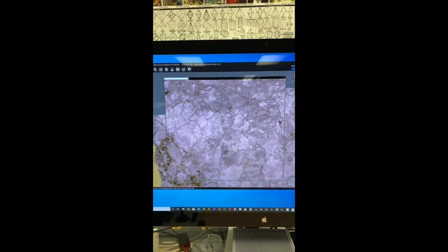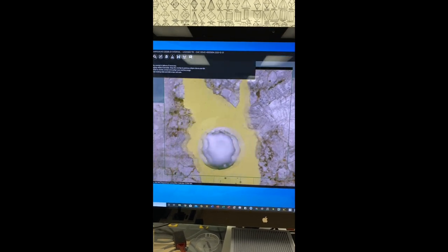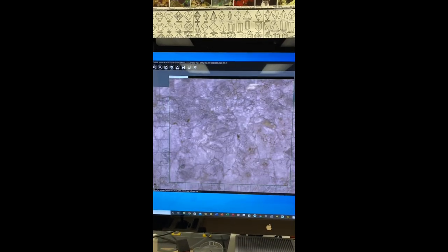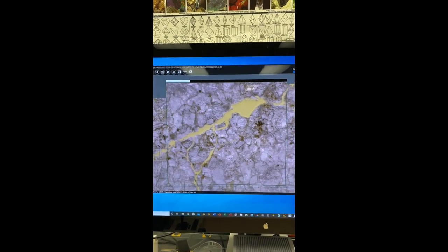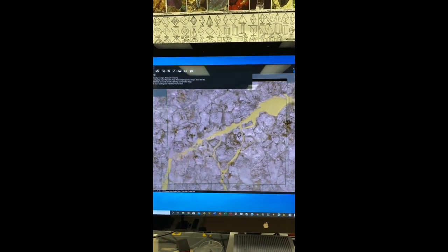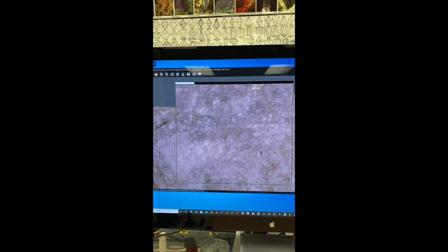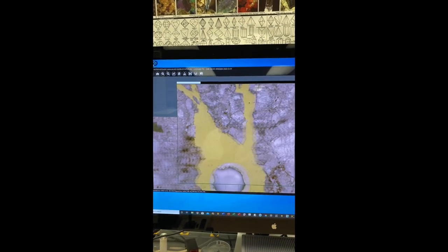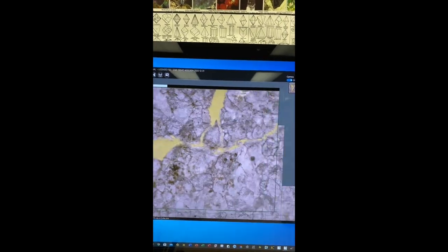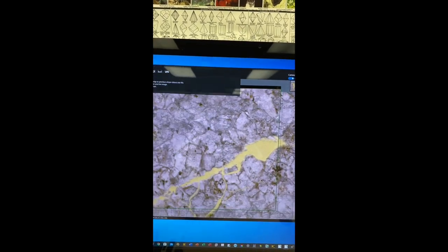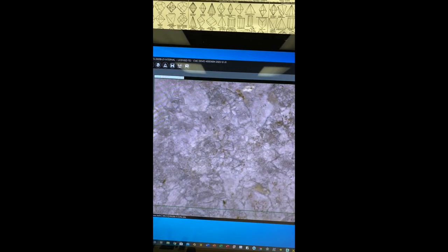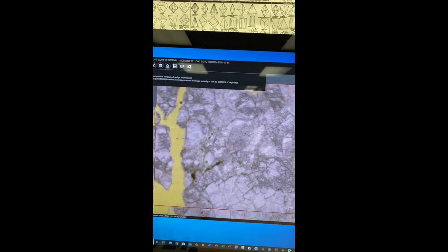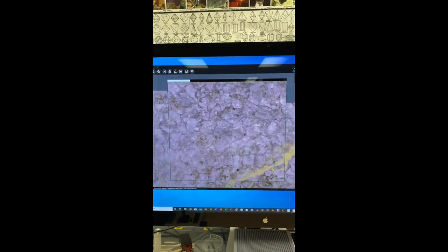Every time you see this green square in the center portion of the software turn red, it means it's scanning too fast. You can slow it down by reducing the acceleration to around 10 or 15, then it will scan without any interruption. But with 20 setting it's doing the automated scan really fine.